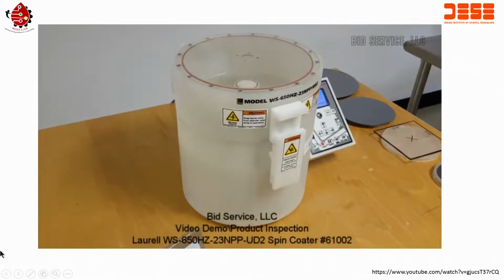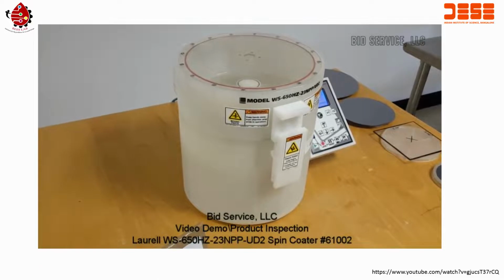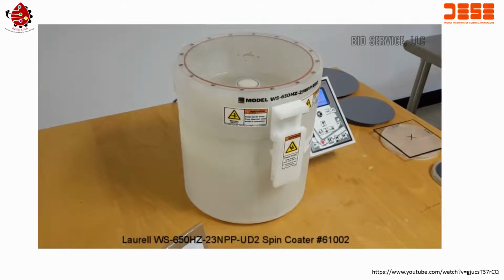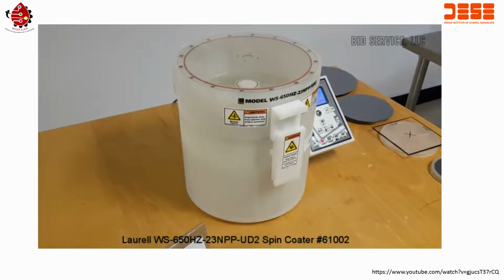This is the Laurell WS650HZ spin coater. It has a maximum rotational speed of 12,000 RPM. The controller allows operator interaction in real time during the process execution, including pausing, stopping, and continuing on from that point.